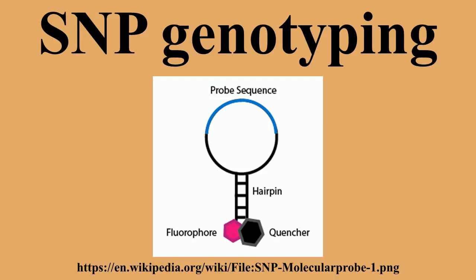The assay has also been adapted in several ways for use in a high-throughput format. In one platform, the allele-specific probes are anchored to microspheres. When cleavage by FEN generates a detectable fluorescent signal, the signal is measured using flow cytometry. The sensitivity of flow cytometry eliminates the need for PCR amplification of the target DNA. These high-throughput platforms have not progressed beyond the proof of principle stage, and so far the invader system has not been used in any large-scale SNP genotyping projects.